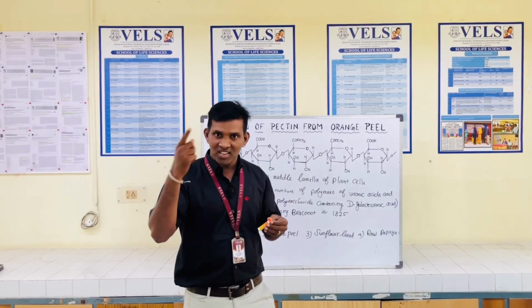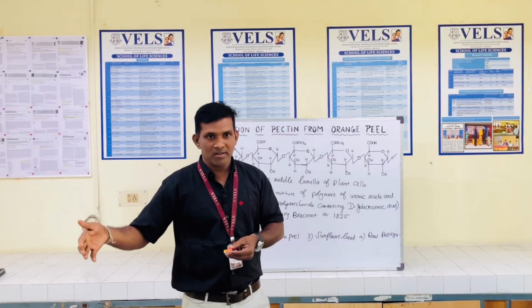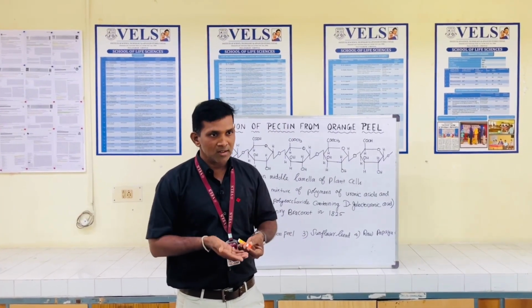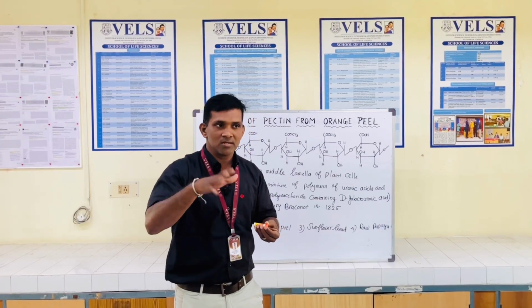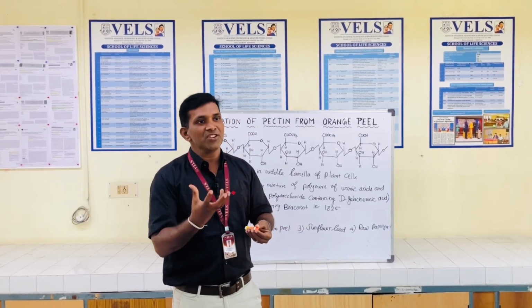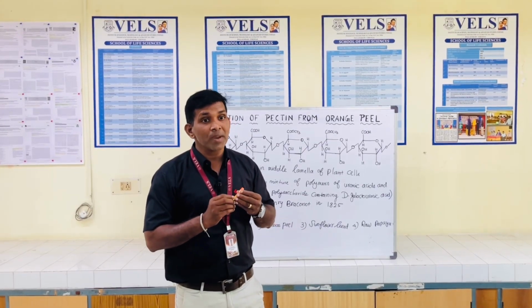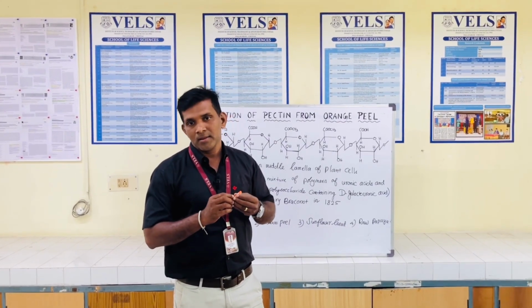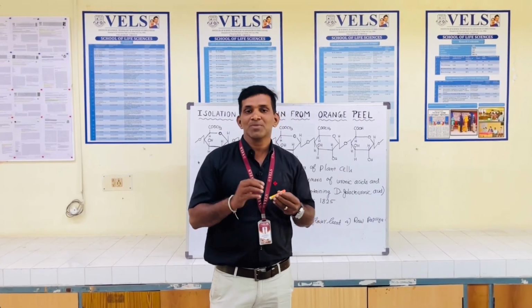After 3 hours, take the solution and cool it. Take nylon cloth, filter to remove the dust and waste particles, take the filtrate and add isopropyl alcohol or n-propyl alcohol, approximately 50 ml.